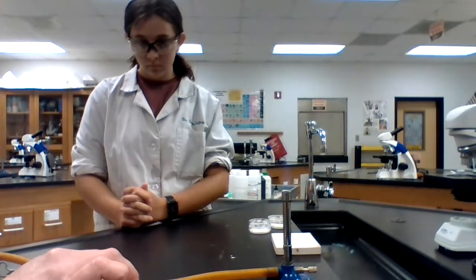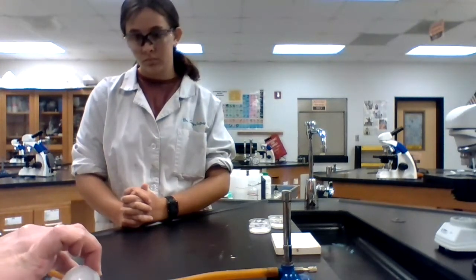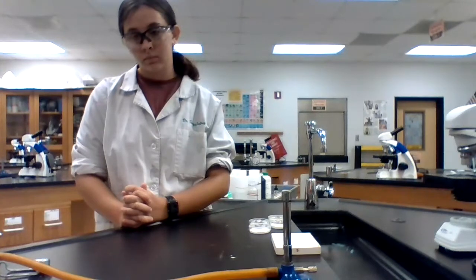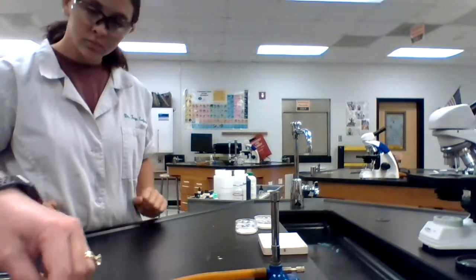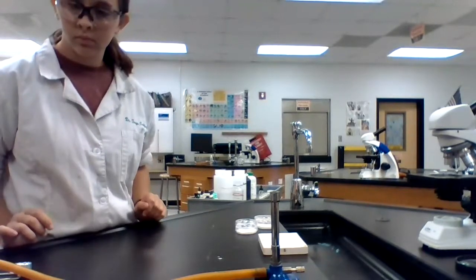And the procedures are all in your blue textbook for Lab 9.5, which is on page 251 of the Chapter 9 Blue Book. And we've added distilled water. I'm going to turn out the lights. Let me put these in the right order. So we're going to start with sugar, salt, potassium chloride, calcium chloride, boric acid, and zinc chloride. All right, we got it in the right order.